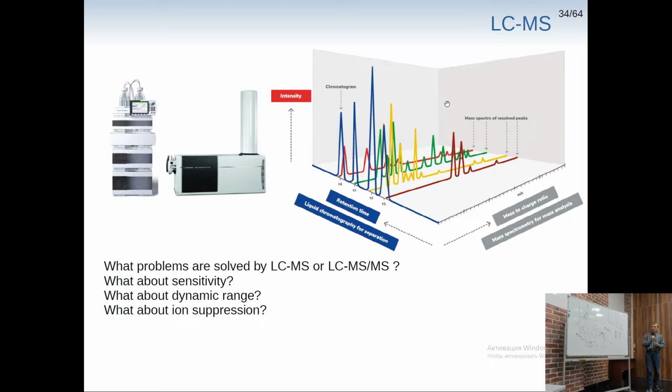But even though this idea is really nice and we've already put here a lot of filters which allow us to choose some of those peaks to be fragmented and identified, what do you think? If we have the same sample the second time, will we get the same peaks for fragmentation?